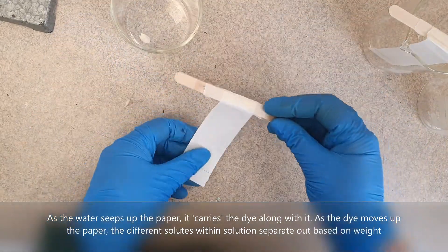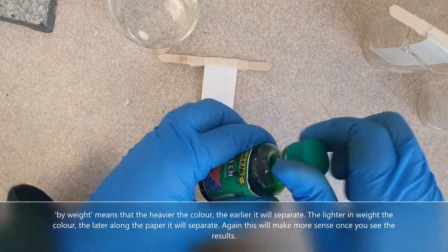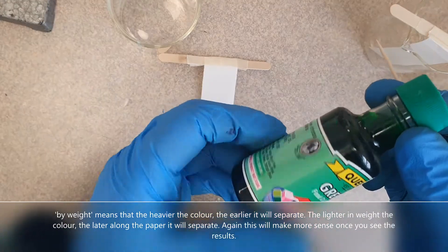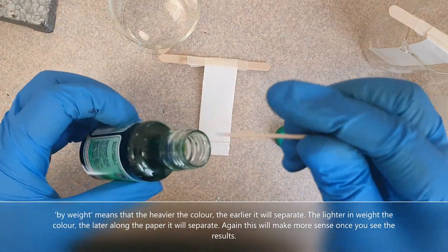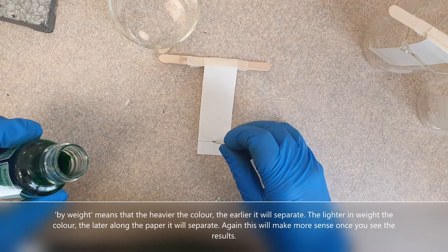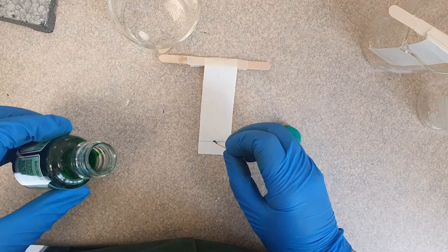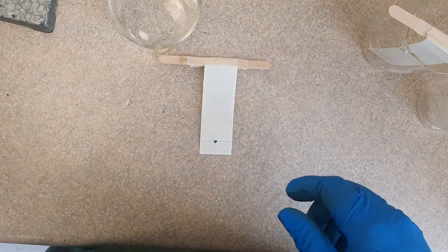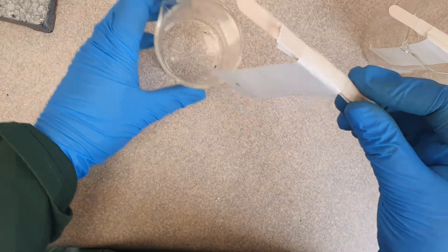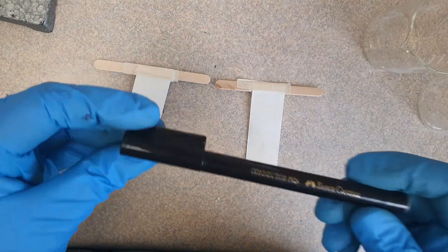We want to separate the colors in the food dye, so we're going to get some food dye onto the paper. I'll use a little toothpick and put a tiny dot there — I might just add a little bit more. There we go, a little dot of food dye on the paper. Then I'm going to put that in the beaker and add a little bit of water.